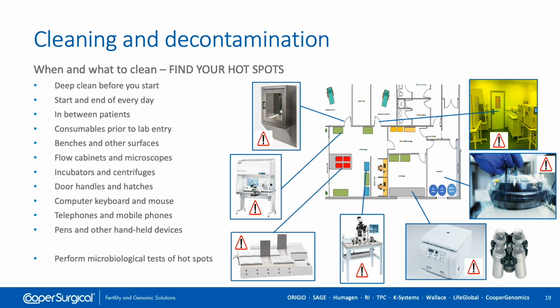A deep clean needs to be conducted before starting up and should probably be repeated every 6 months. Additionally, it's important to disinfect work surfaces at the beginning and end of each day, as well as between each patient. The outer packaging of disposables and media should be removed with gloves and their contents cleaned before bringing them into the laboratory. When disinfecting lab fixtures and equipment, it's worthwhile paying particular attention to hatches and doors to clinical procedure rooms. Such hotspots for microbial contamination can be identified using microbiological tests. It's also important to log all cleaning activities for traceability.